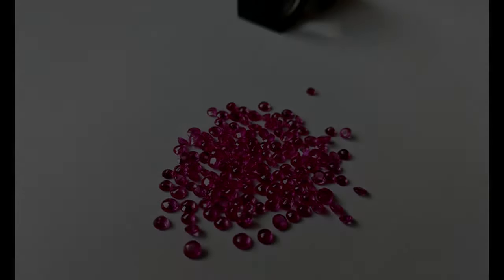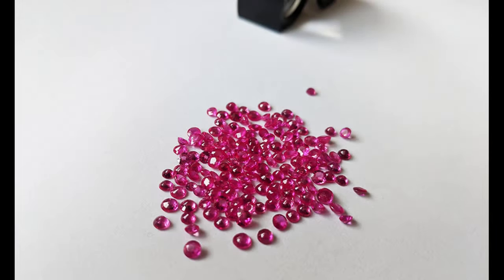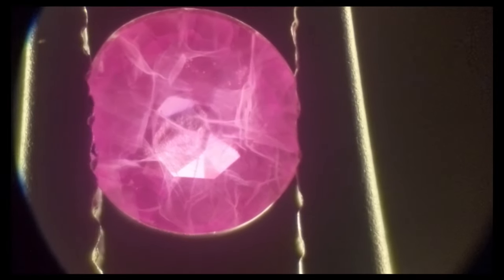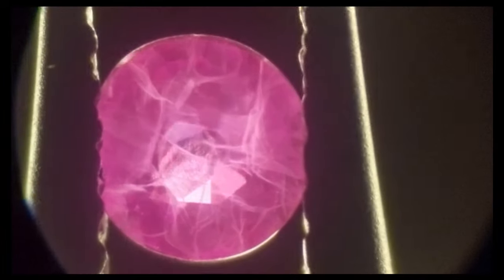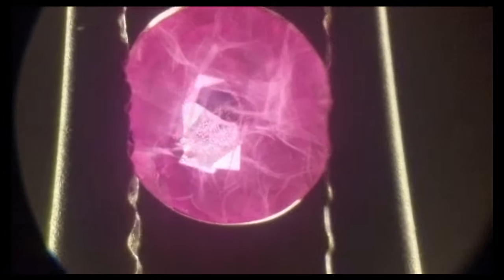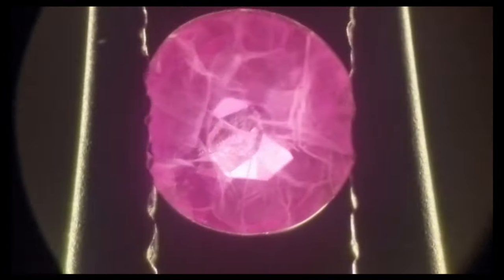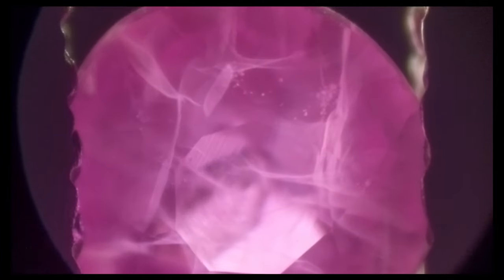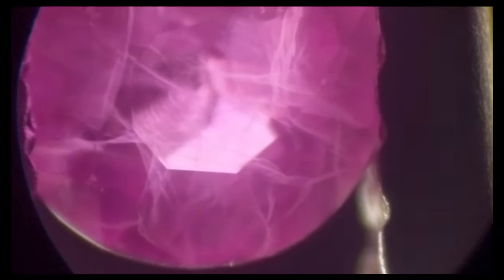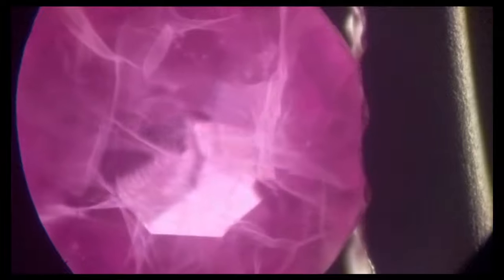Okay so the final microscope video I'm going to show you today is the two millimeter pinkish red rubies. And in the microscope you will notice immediately these wavy lines which look like checkerboard like pattern. This is actually a intentionally made inclusion which people try to do to trick us to think that the stone is a natural stone. This process is called quench crackle.